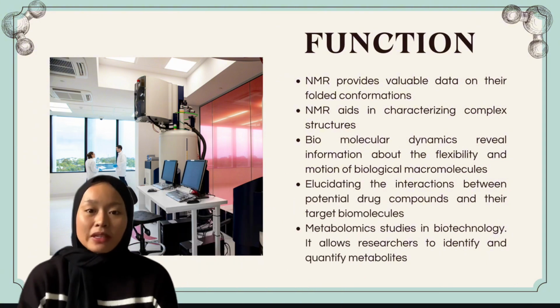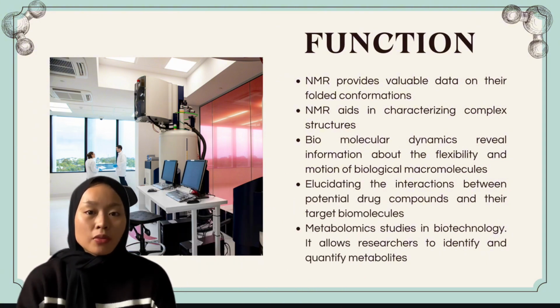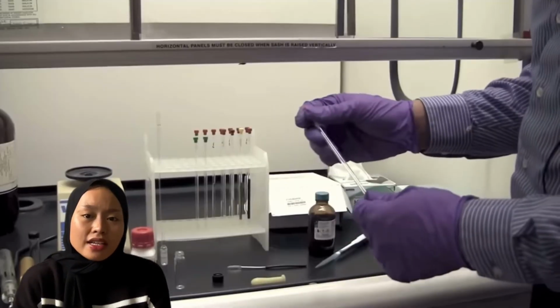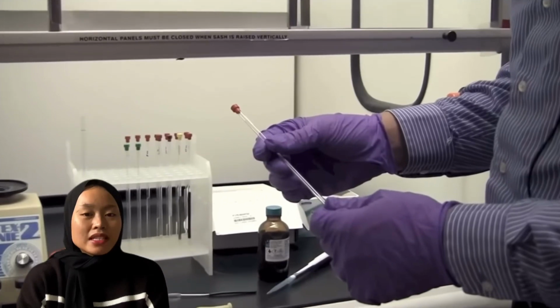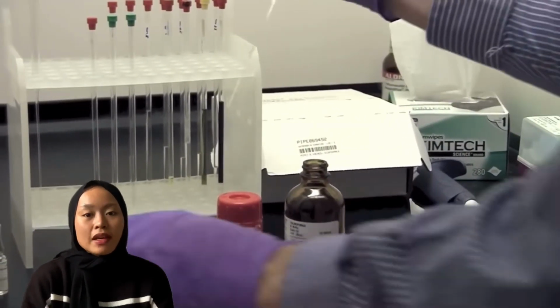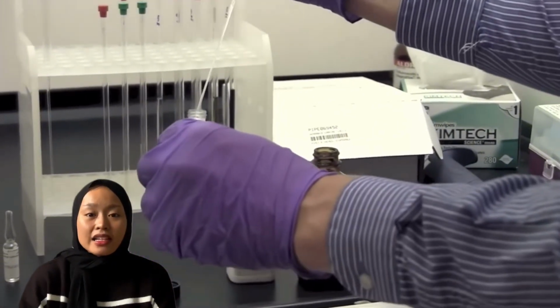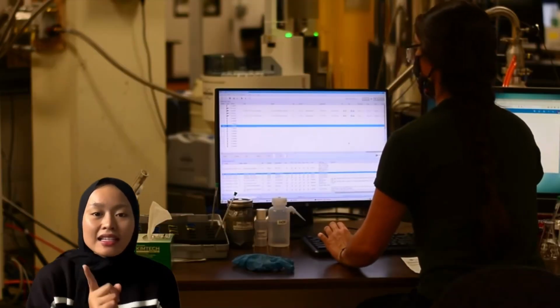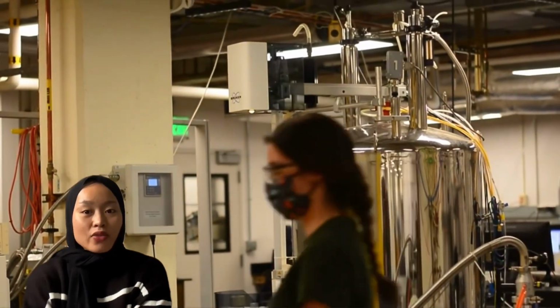Lastly, NMR spectroscopy is integral to metabolomics studies in biotechnology. It allows researchers to identify and quantify metabolites, providing a comprehensive view of cellular metabolism. This information is crucial for optimizing bioprocesses, understanding cellular responses to environmental changes, and enhancing the production of bio-based products.